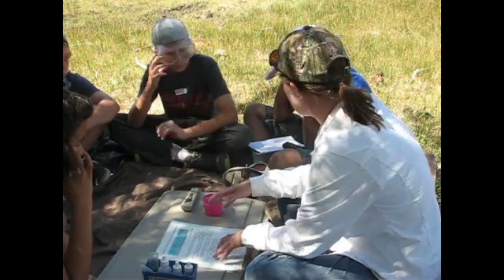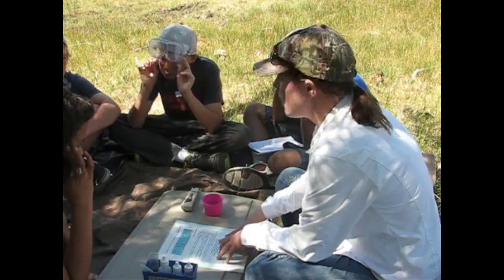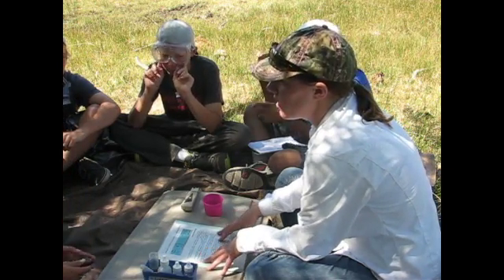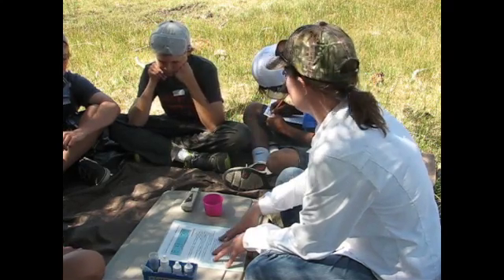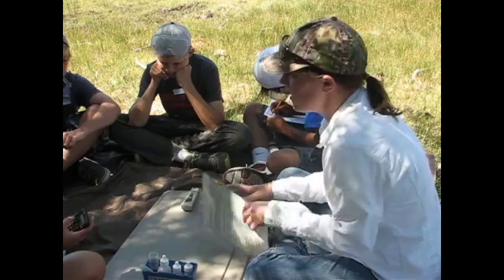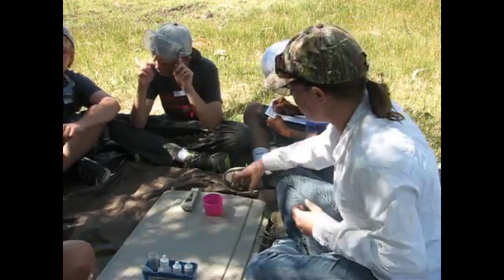Do you have any other questions for TDS? Where do dissolved minerals in the creek water come from? So did we figure out where the dissolved minerals come from? Rocks. They come from rocks and mountains. Okay. So our other test is for water hardness.